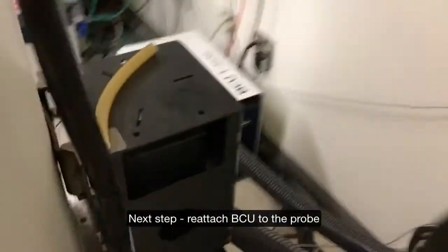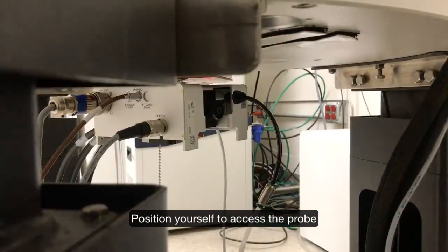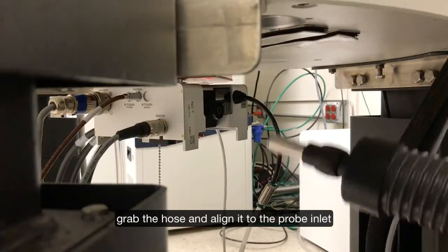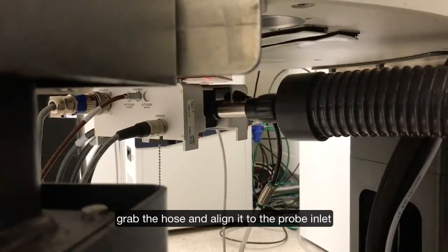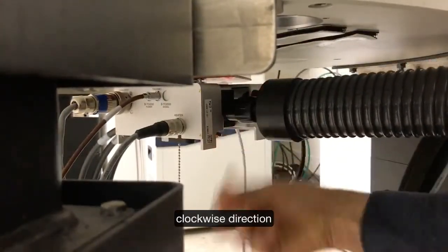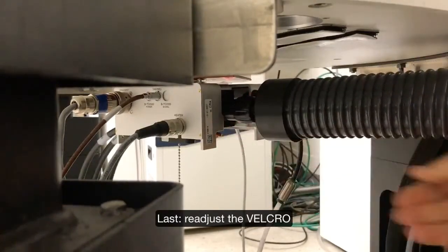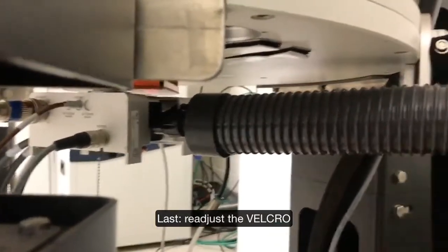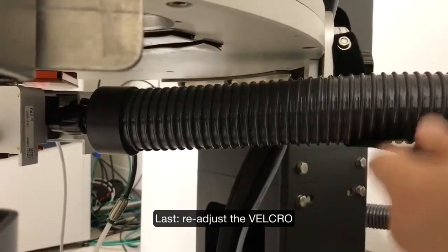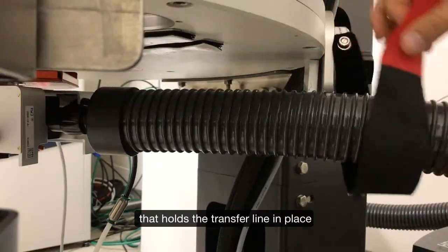The next step is to reattach the BCU back to the probe. I am going to grab this pipe and put it over here. Now I am going to align it, push it in, and then screw in the retaining nut. The last part is to reattach the velcro such that it holds the pipe in place.